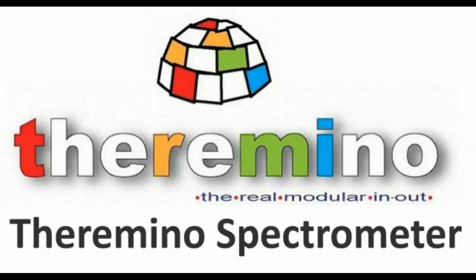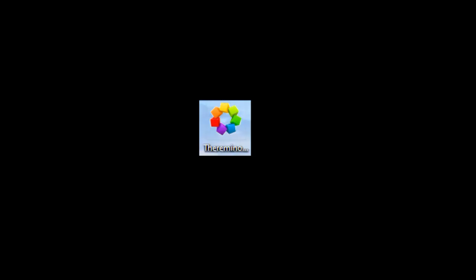This small video should help you make use of the Theramino spectrometer. Begin by checking to see that the software has been installed on the computer. There should be an icon like this on the desktop.